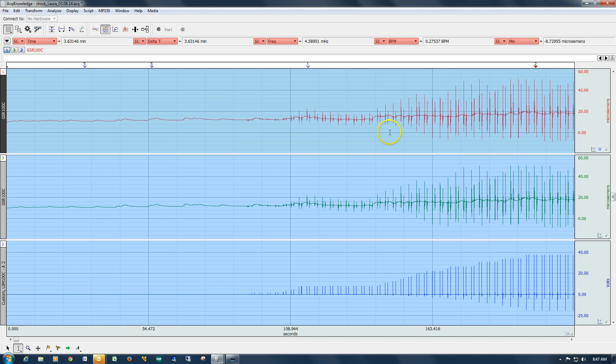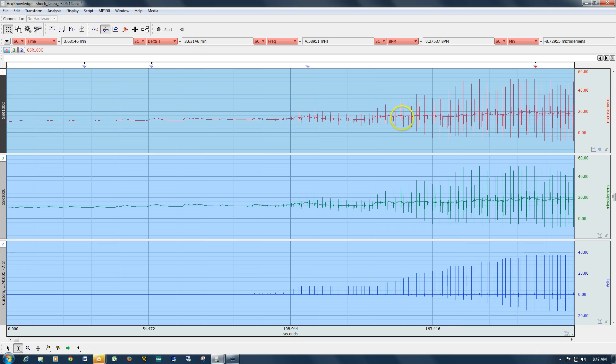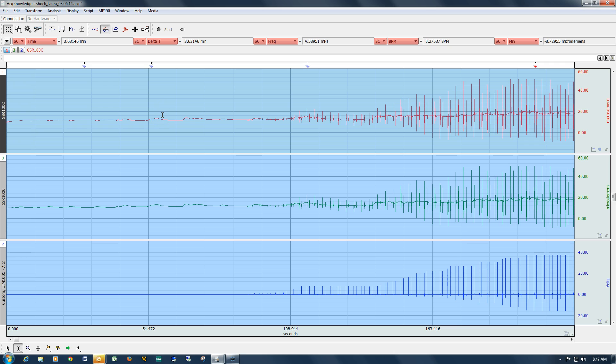If we run the mean smoothing over this, the data will start to distort by the time it's removed these spikes. But the median smoothing is very good for handling this situation. It works very well at removing rapid frequency spikes, such as these, from a relatively slow moving signal, such as electrodermal activity.